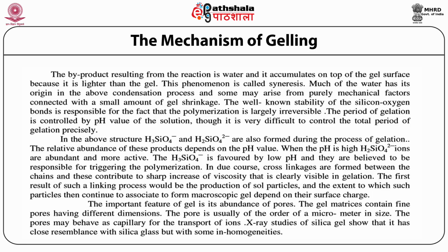The well-known stability of the silicon-oxygen bonds is responsible for the fact that the polymerization is largely irreversible. The period of gelation is controlled by the pH value of the solution, though it is very difficult to control the total period of gelation precisely.